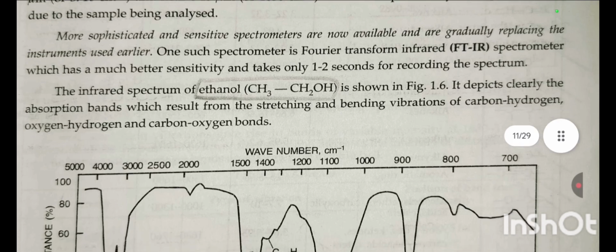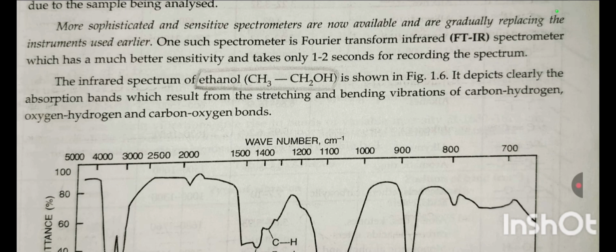The infrared spectrum of ethanol, CH3CH2OH, is shown in the figure.